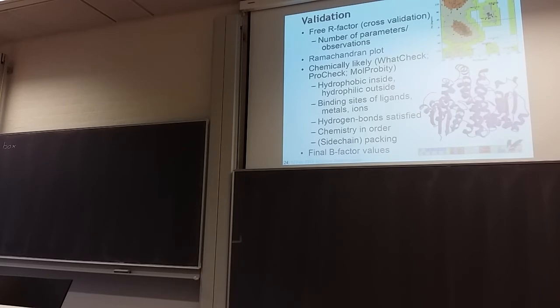It has one drawback. What's the drawback? There's a bias towards known structures. Yes. So if you're starting to make structures of, let's say, exotic membrane proteins, they might actually be very different in some respects from the known structures, which are predominantly soluble proteins, right? Doesn't have to be a lot different. So usually it still works okay, but there are some differences there.